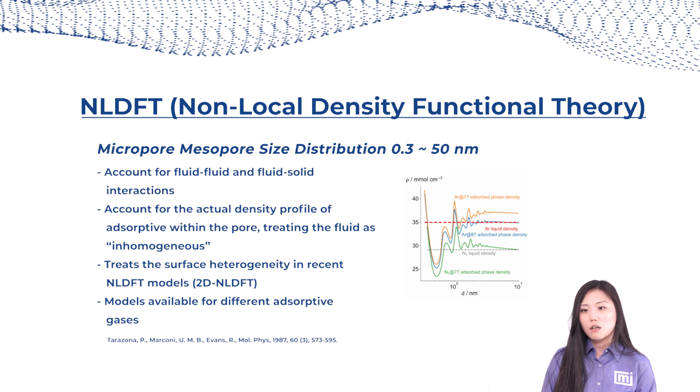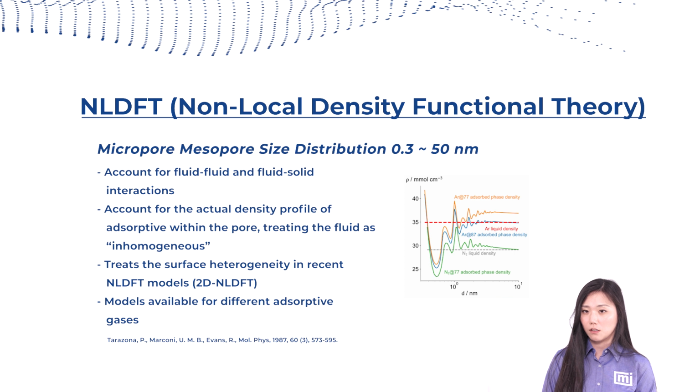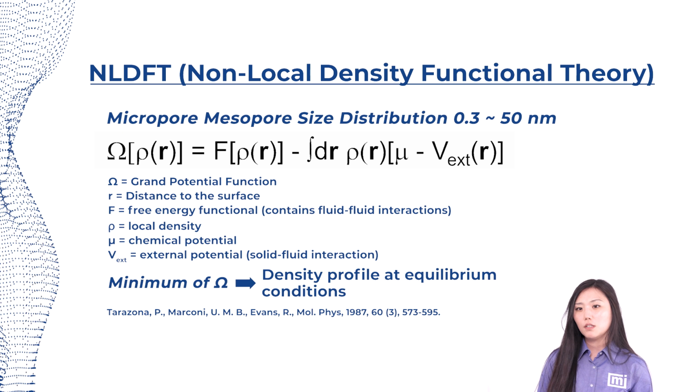More recent models called 2D NLDFT also take the surface heterogeneity into account, and all the different models are available on our website. So let's take a look at the equation used for simulating and calculating the density profile.